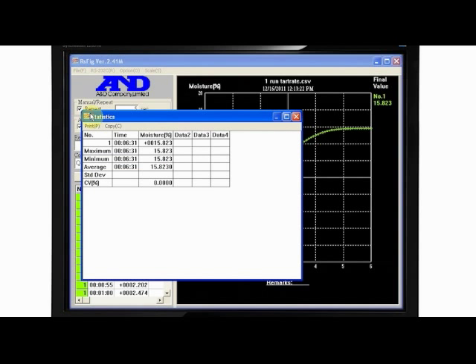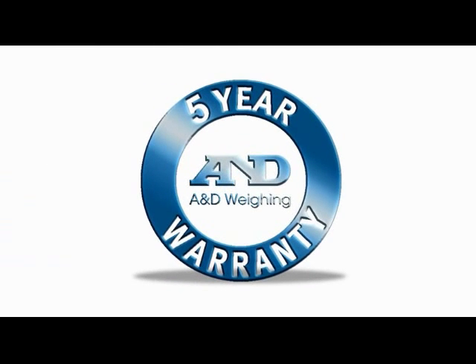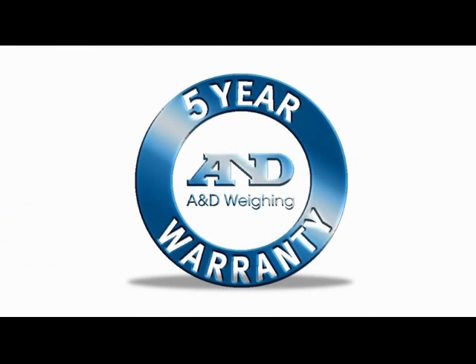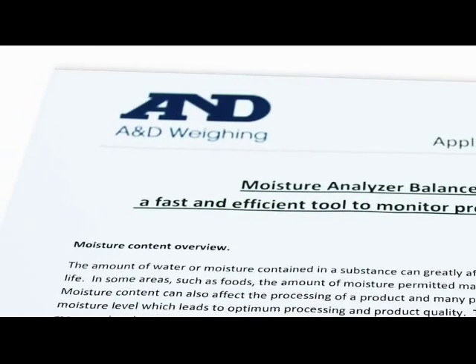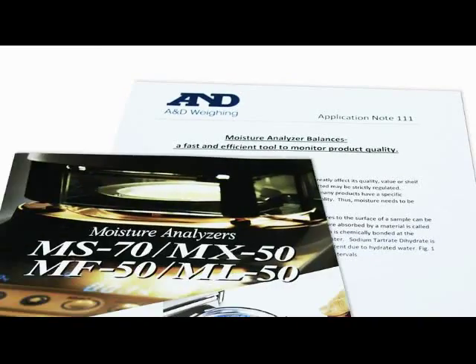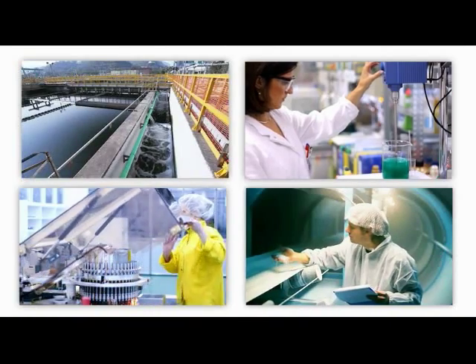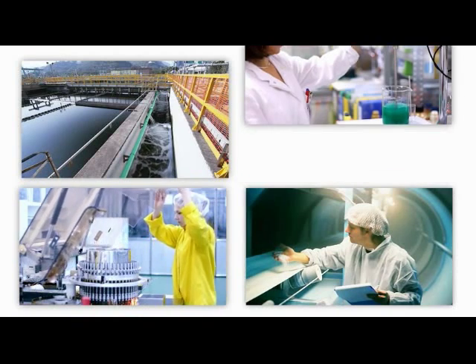WinCT calculates statistics and saves data as an Excel file. A&D moisture analyzers are backed by the industry's best warranty, five years, and have a proven track record of years of service. They can help you improve your product and your processes.